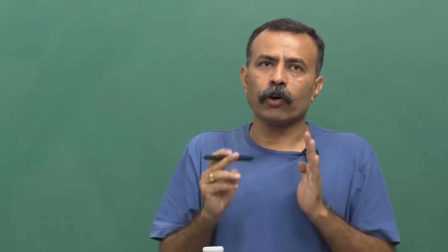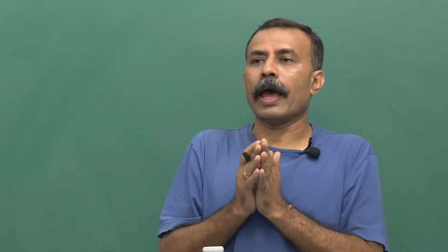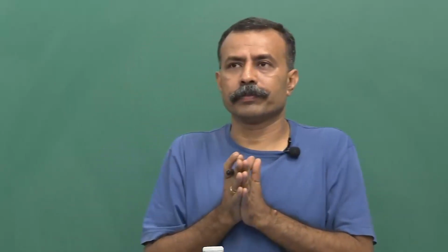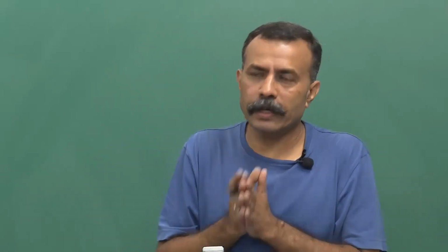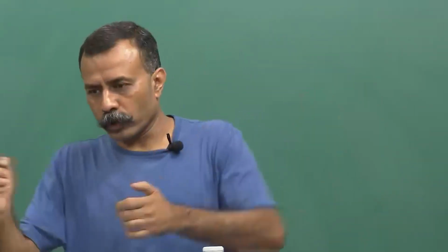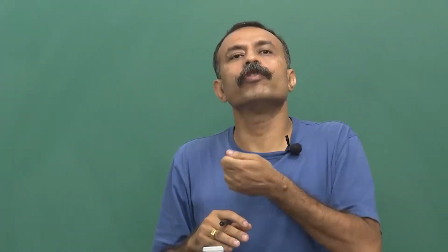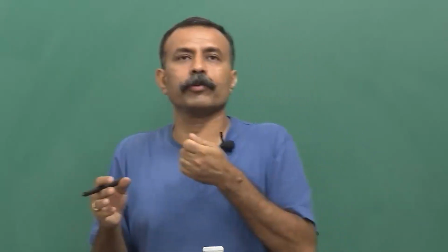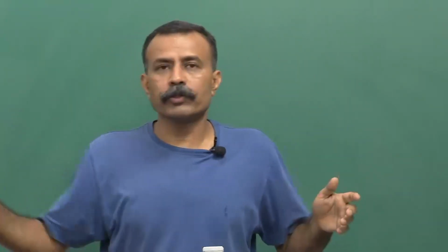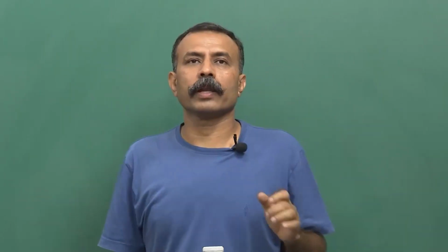As long as you are following some of these very basic fundamental rules, and when you are inside the lab, be dedicated for that period of time. Do not do things like talking while doing the work, because whenever you have to talk, you have to remove your mask. I have nothing against talking, but when you remove your mask you spread several things all over the place. Especially this holds true when you are working on the laminar flow hood.